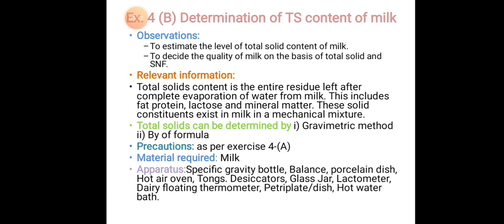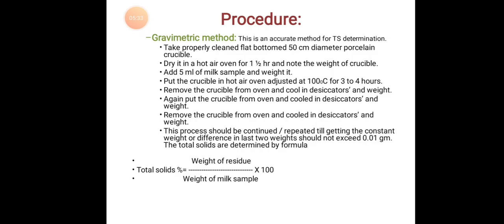Precautions as per exercise 4A. Material required: milk. Apparatus: specific gravity bottle, balance, porcelain dish, hot air oven, tongs, desiccators, glass jar, lactometer, dairy floating thermometer, petri plate, dish, hot water bath.